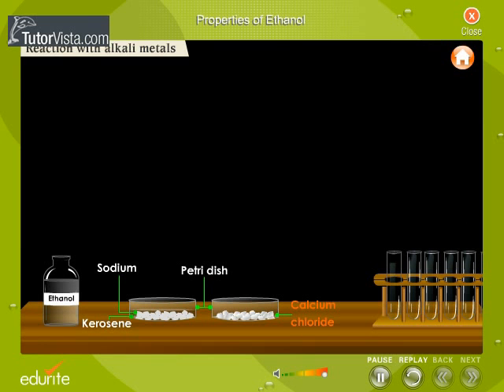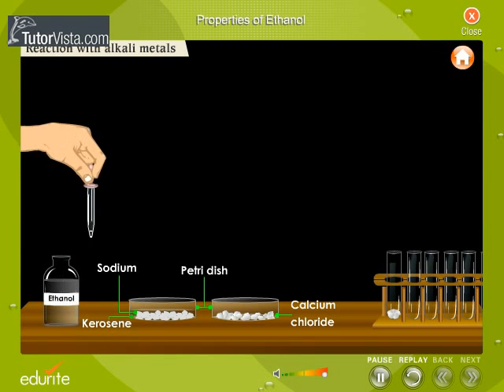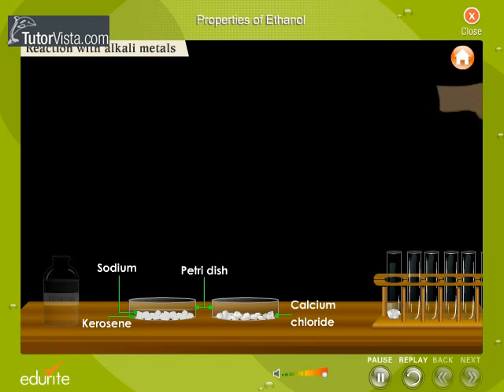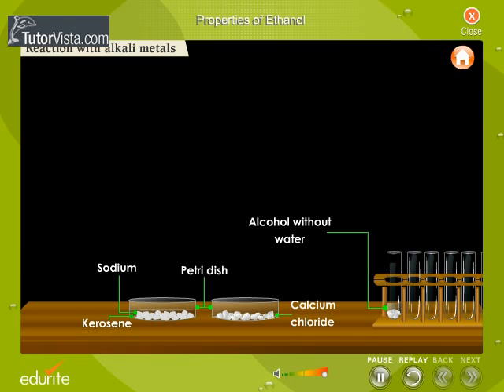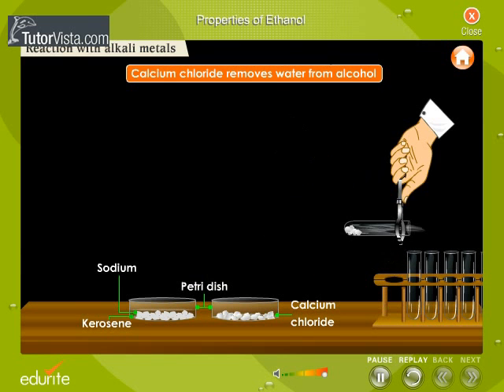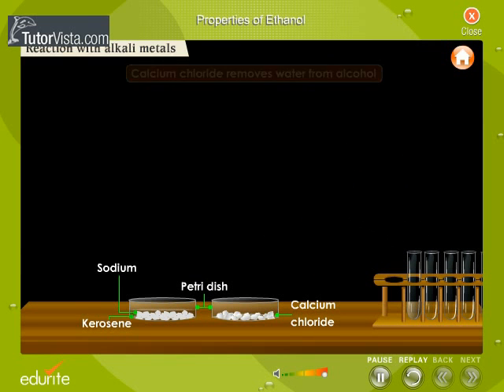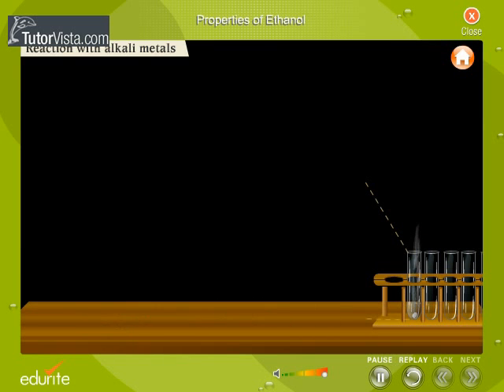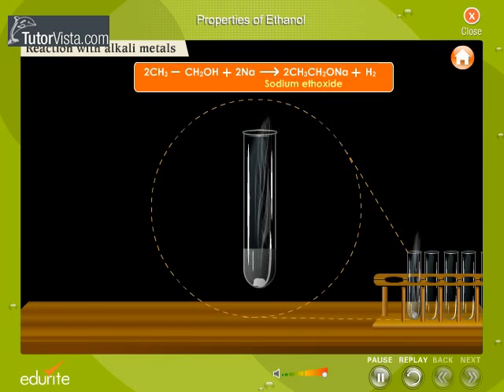Anhydrous calcium chloride is taken in a test tube and a small amount of ethanol is added. Calcium chloride is a dehydrating agent that absorbs moisture from ethanol. The moisture-free ethanol is now decanted into a dry test tube. A small piece of sodium is dropped into the test tube containing ethanol. Brisk effervescence is observed due to liberation of a gas.